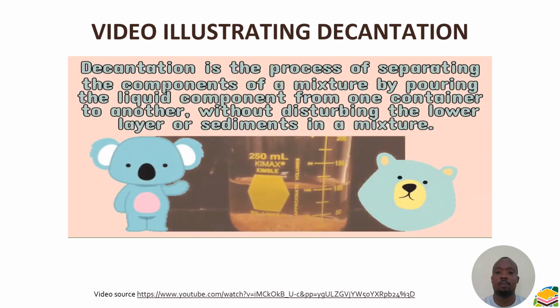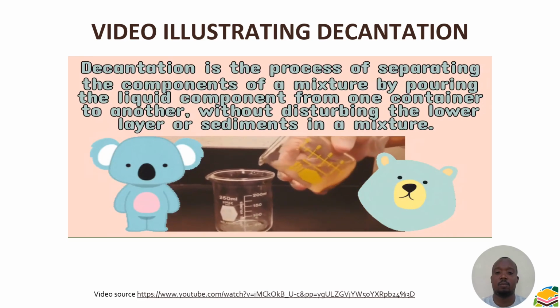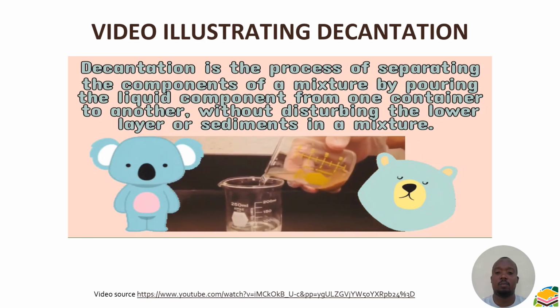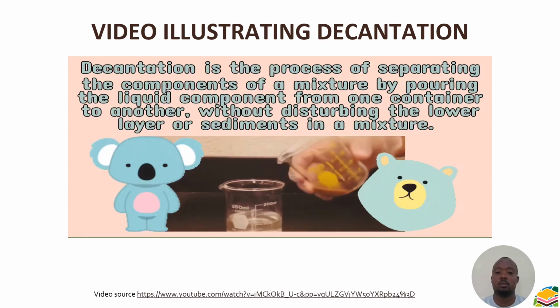Decantation is the process of separating the components of a mixture by pouring the liquid component from one container to another. Here, they're just using a mixture of sand and water. In the previous description, there was a mixture of oil and water, without disturbing the lower layer or sediments in the mixture.